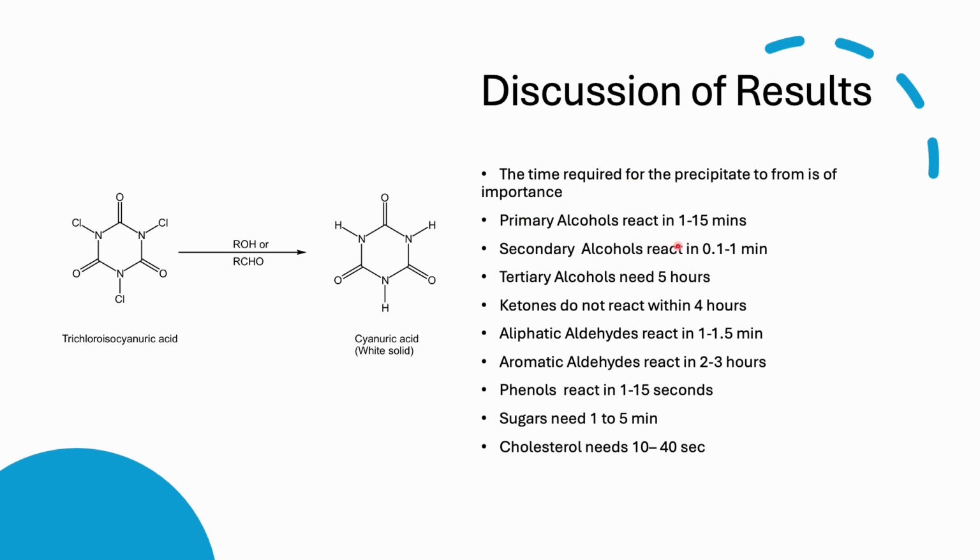Primary alcohols react in 1 to 15 minutes. Secondary alcohols, on the other hand, react way faster, in 0.1 to 1 minutes.